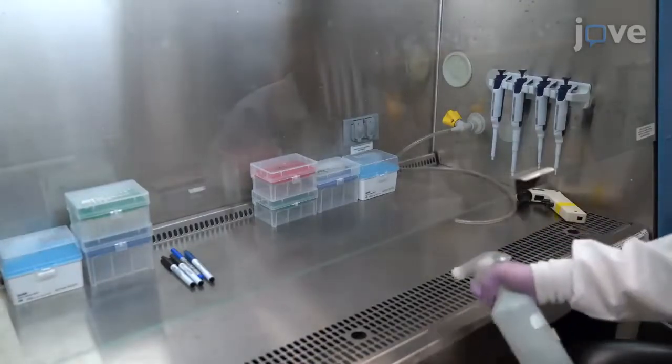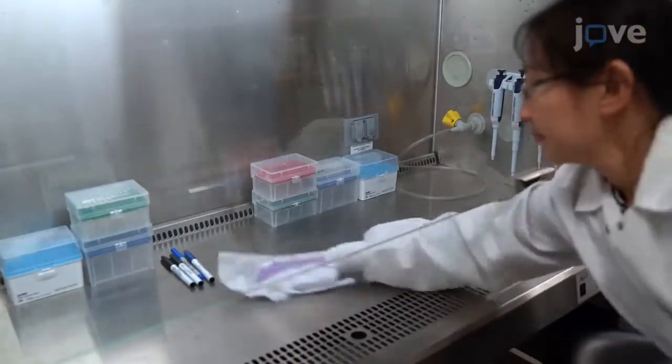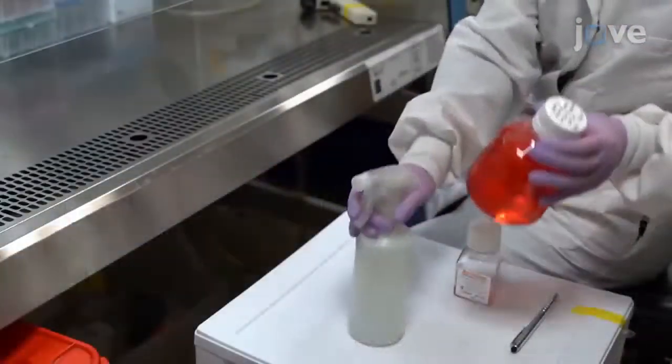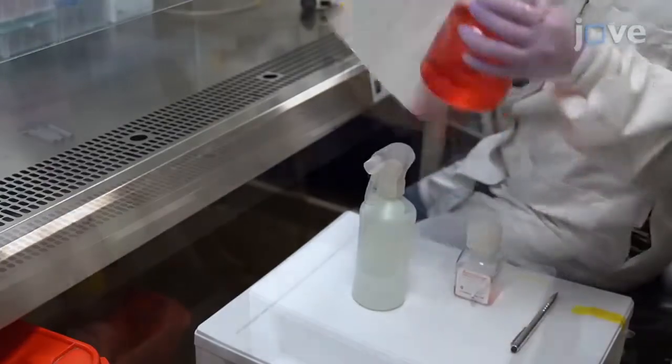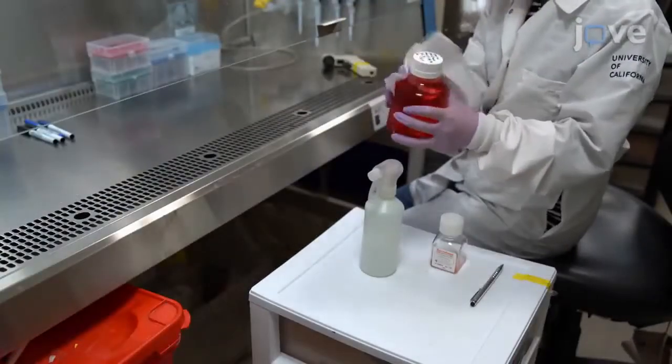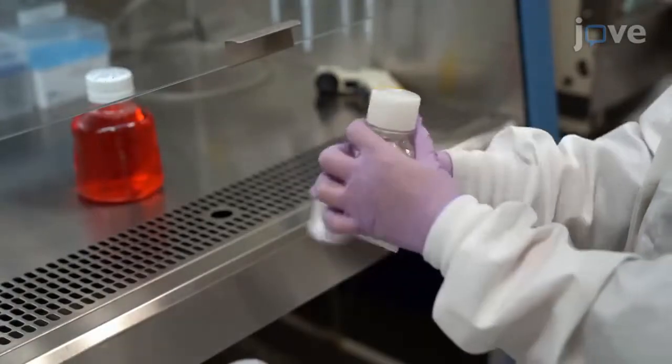Spray the tissue culture hood surface with 70% ethanol and wipe down the sprayed surface with paper towels. Next, spray the medium and cell detachment solution bottles with 70% ethanol and wipe them down with paper towels. Transfer the cleaned bottles into the tissue culture hood.